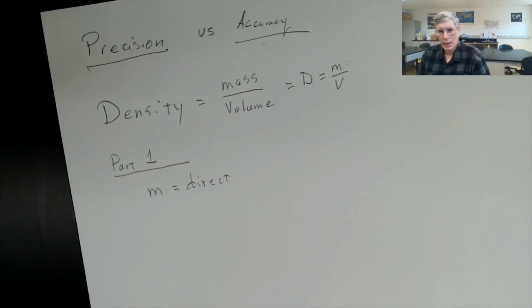If you are in my class, your precision is counted double on the first labs, including this lab, so make sure you use the correct precision of all measuring devices.